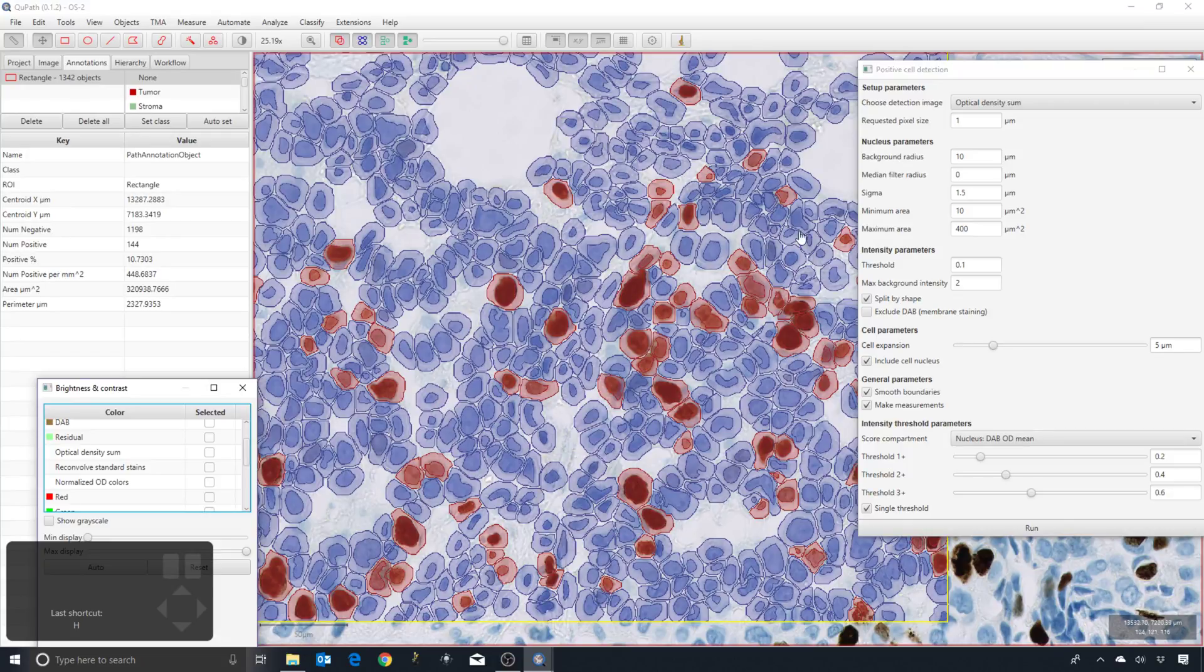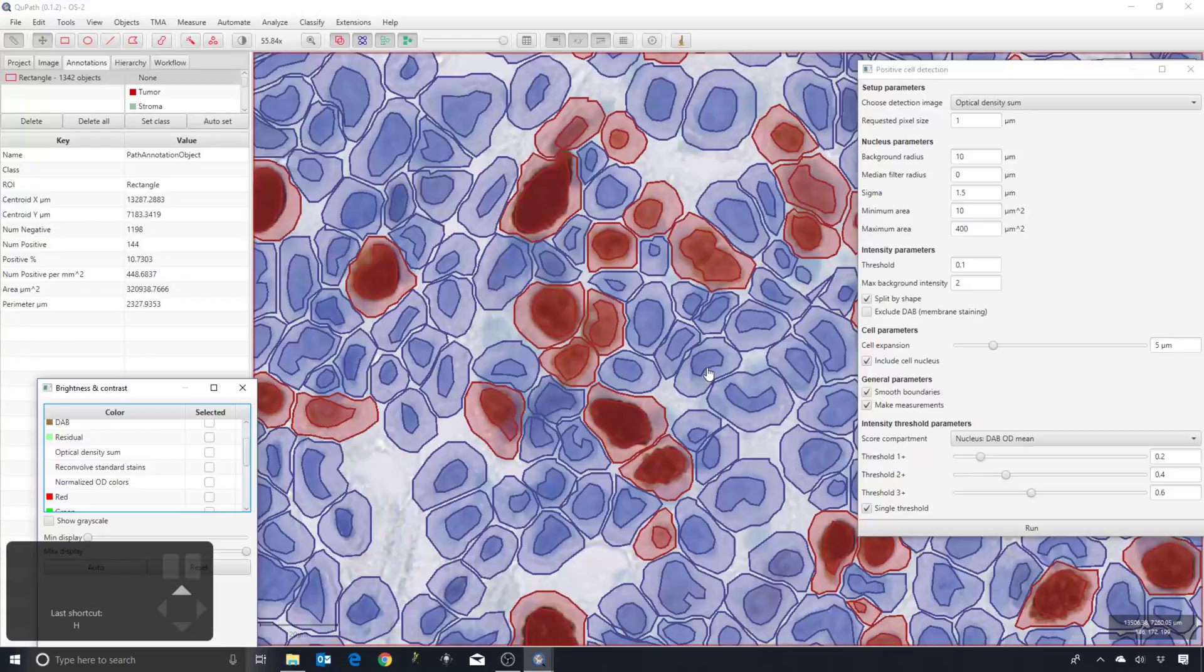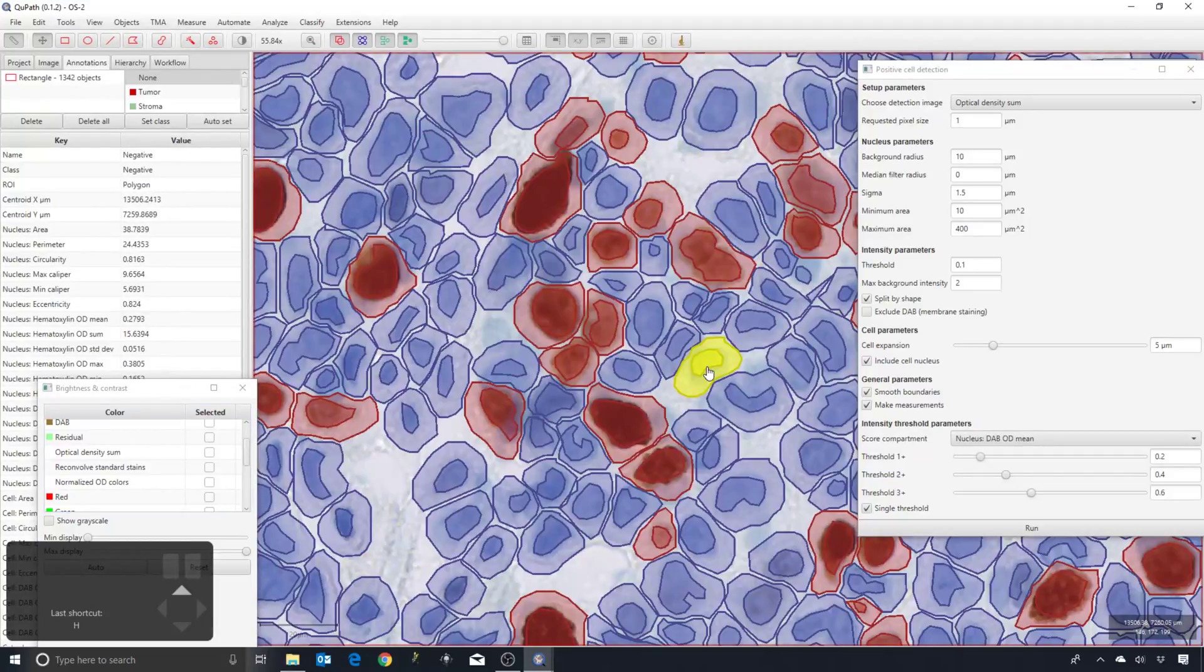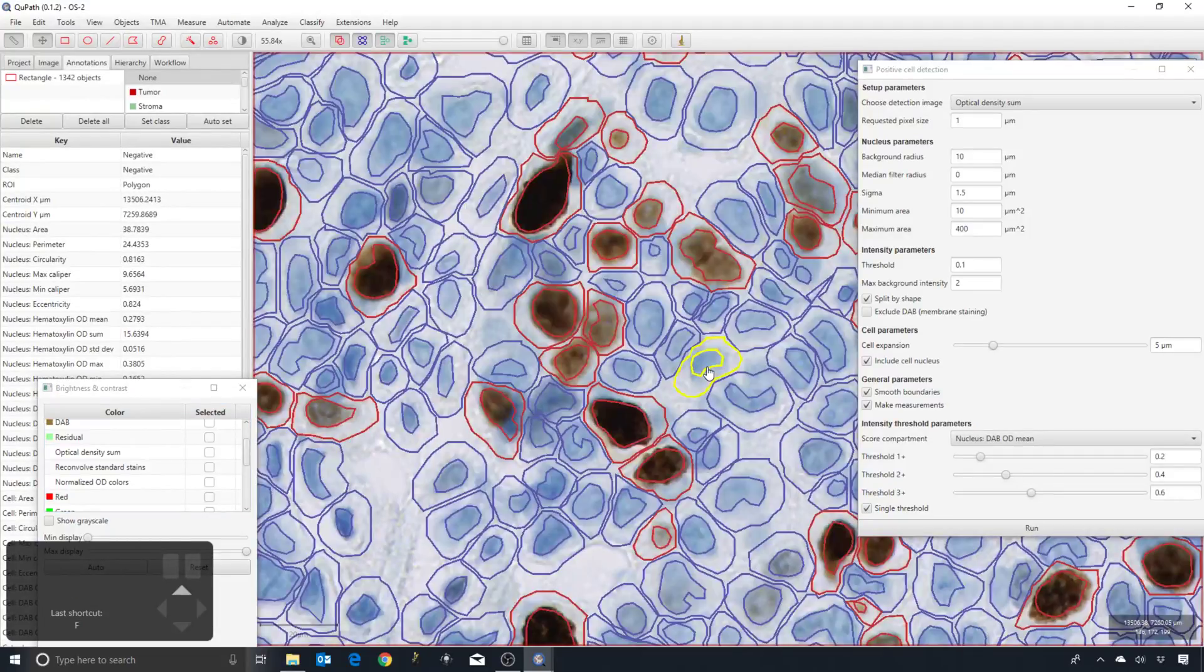Cell expansion - you can see that for all of our cells we have an estimate, or some kind of prediction, of what the entire cell boundary looks like.